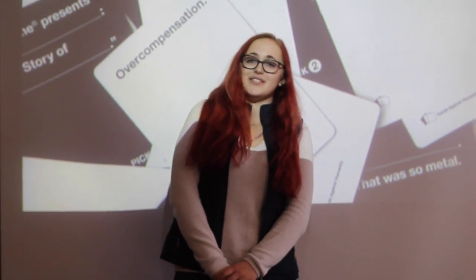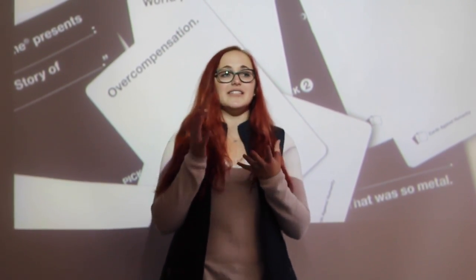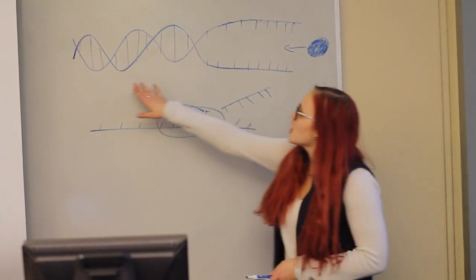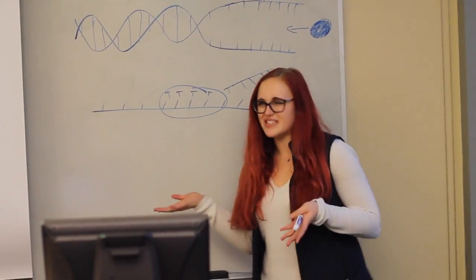And today we'll be talking about Sanger sequencing, which is this really cool method of essentially finding out what the exact nucleotide sequence of a DNA strand is. So we start with our double helix of DNA that we all know and love. You've seen it in movies and in all that popularized science.